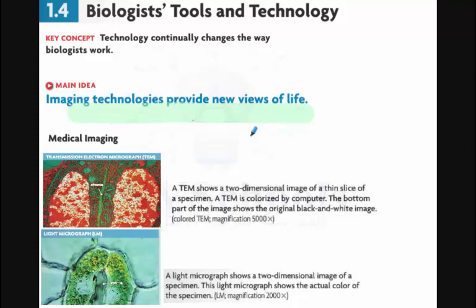We looked at the different types of microscopes. We looked at the light microscope, and we looked at the electron microscope. We looked at how each of the microscopes works, and we looked at differences and so forth.